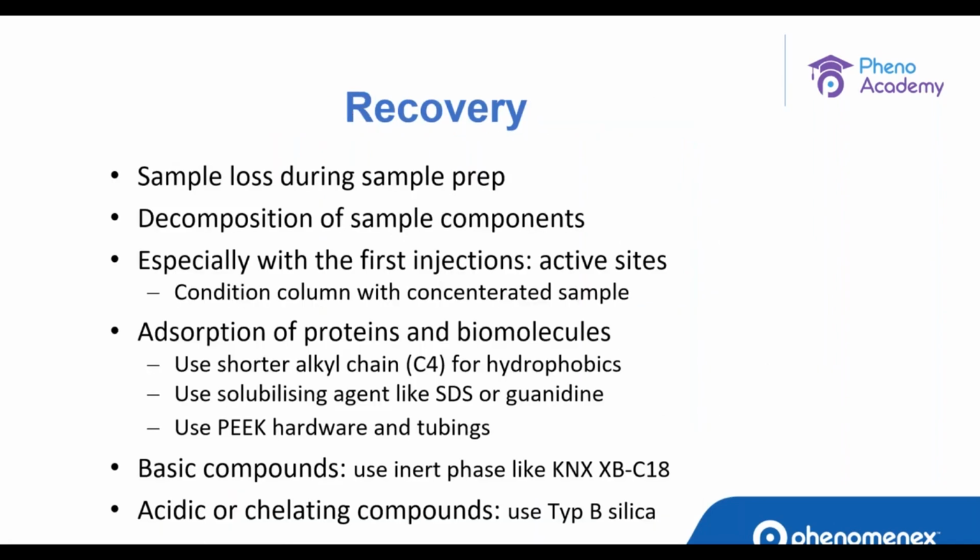Recovery rate problem is a compound related issue. Some compounds are lost during the sample preparation, decomposition of the sample components, priming issue. Sometimes the column needs to be conditioned during the first and second injection.